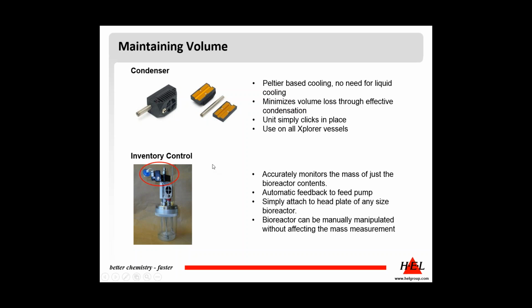In terms of inventory control, we can use foam level detectors and conductivity probes, but we can also use what we call an inventory control. This is normally used on very large scale vessels in the past, and uses hydrostatic pressure to measure the mass of the contents inside the vessel. And actually this little accessory can be used on any vessel that you may have, so it's really third party compatible as well.